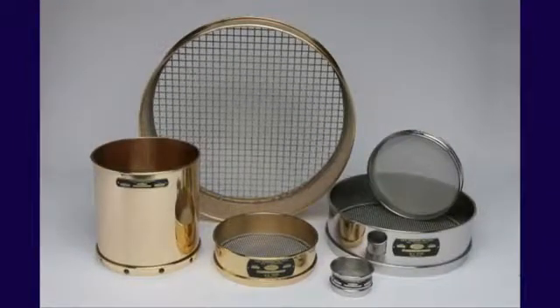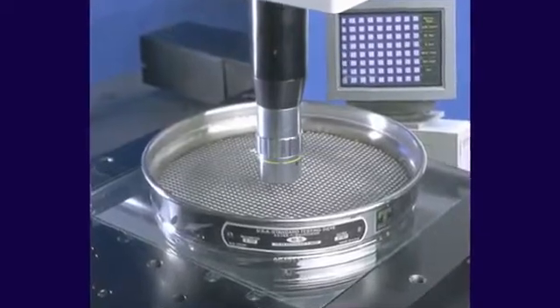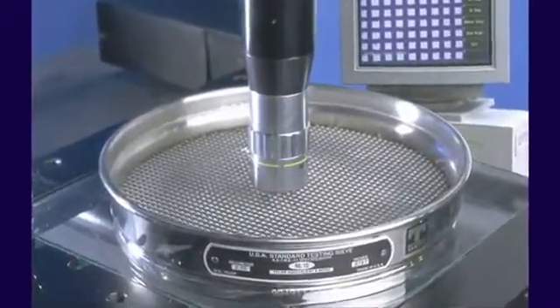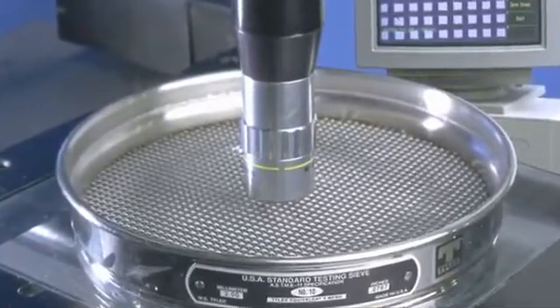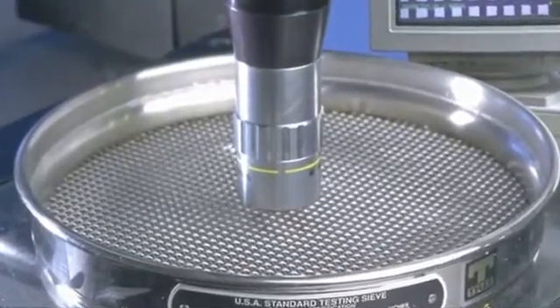Test sieves are available in 3 grades: compliance, inspection, and calibration. Compliant grade test sieves are primarily used. The sieves can also be examined to verify the openings and wire diameters of the mesh in order to ensure compliance to inspection or calibration grades. These examinations provide NIST traceability.